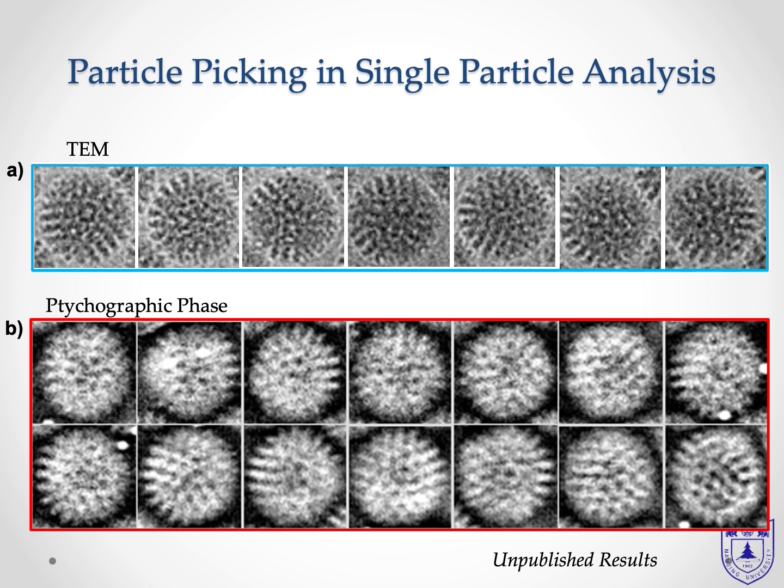Since a large number of phases of the specimen with high contrast can be obtained, we are able to apply the standard particle picking procedure that has been used for standard TEM single particle analysis, SPA. Multiple individual particles can be subsequently picked from the phase and formed into a stack of particle phase images.